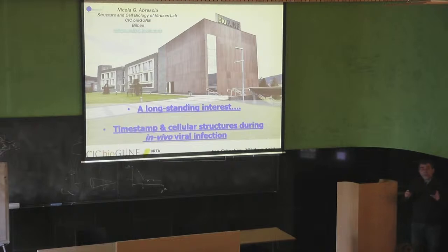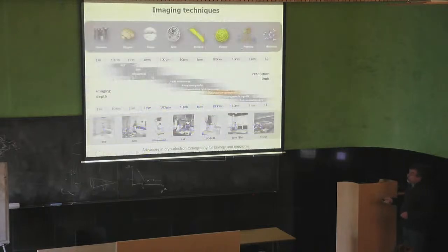So today my talk in this context is split in two topics. The first one, I will tell you where my long interest in electron tomography comes from, and then a project that we started very recently as a challenge, as well, of what Andrei has introduced at the beginning. So in terms of resolution range and systems that we study, in my group we study mainly viruses, and we use cryo-electron microscopy, single particle cryo-EM, also X-ray crystallography when we look at some receptor individual proteins.